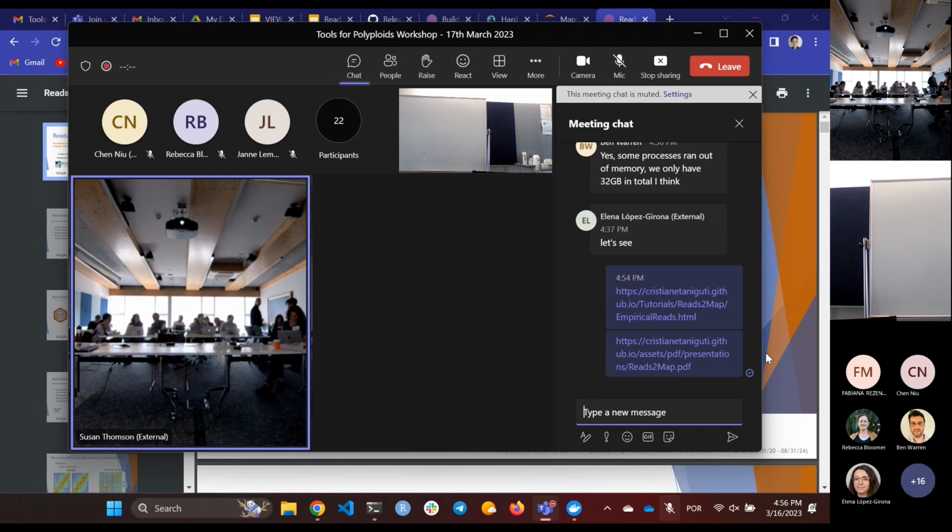Let's go back to this. And then what we want to do is, okay, the whole thing? Yes. So it's still waiting, so you would go back to that batch. So you have the $ at the end. Oh yeah, great. I have all the presentations there for later.